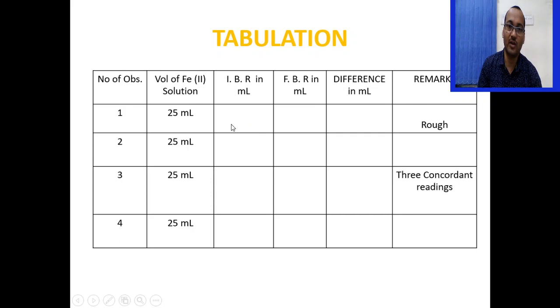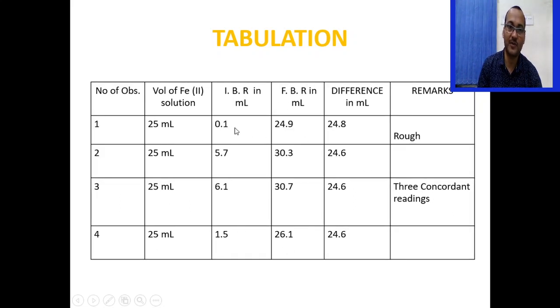In the titration table, record the initial burette reading, final burette reading, and the difference for 25 ml iron solution each time. For example: IBR 0.1, FBR 24.9, difference 24.8 (rough reading); next titration IBR 5.7, FBR 30.3, difference 24.6; and two more titrations also giving 24.6. So 24.6 ml is the concordant reading for ferrous iron.